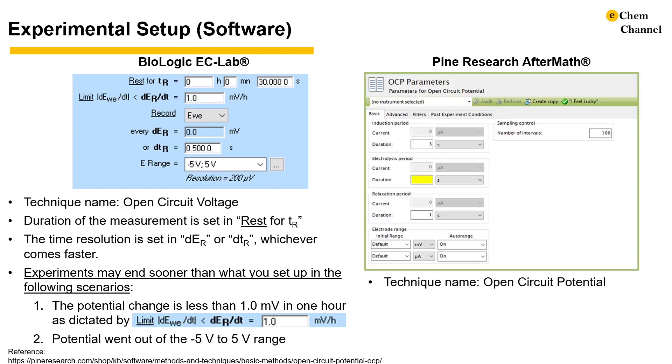In other potentiostat software, the setup will be similar but likely with different terminologies. For example, in Pine Research's AfterMath software, the duration of measurement is set in the electrolysis period, and the number of intervals controls the time resolution according to this equation.